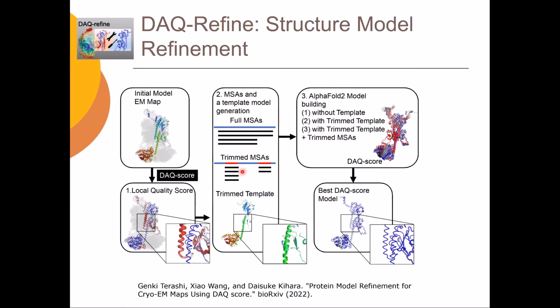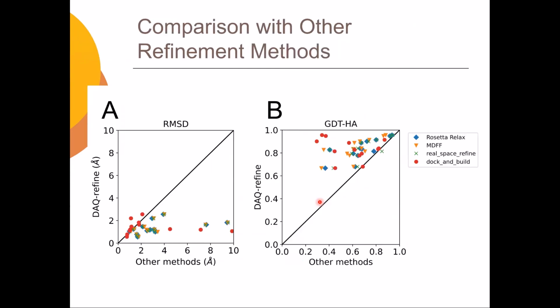So then AlphaFold only has the information to remodel those potentially wrong regions. We tried some other combinations, but this is a quick hack to AlphaFold to get only the local region fixed. This also has a web server, so you could try that.